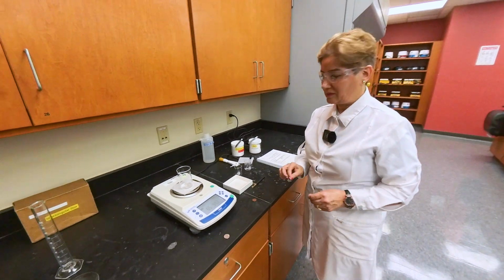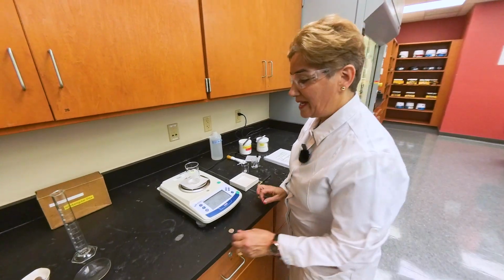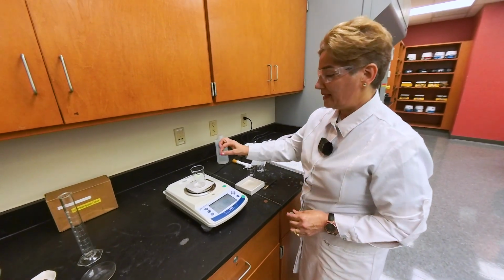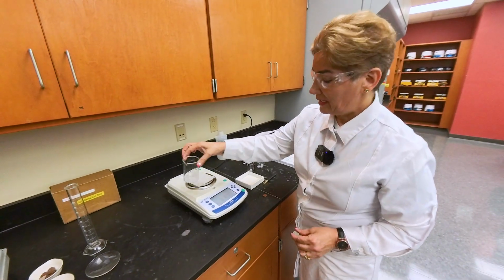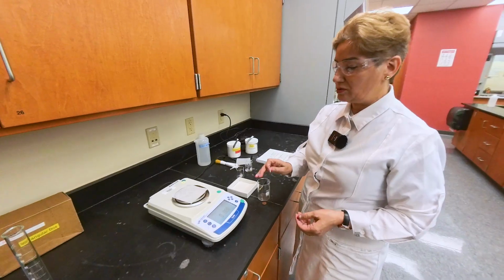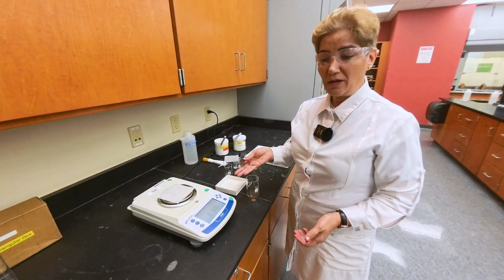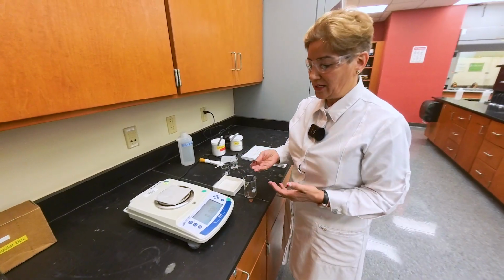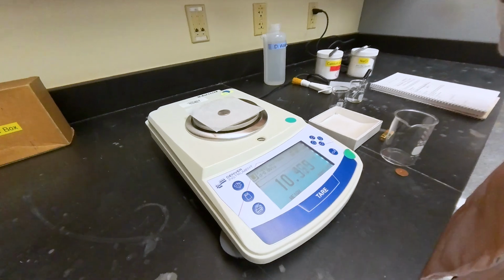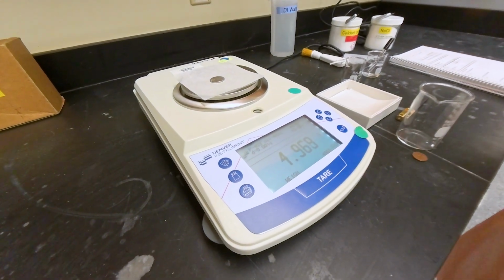You learn about the significant figures in lecture. In the lab, we put that in practice. What we do here is make sure that the number we are recording represents the accuracy of the measuring device. If I record too many decimal places that are not showing on the scale, it is a fake number, it is not ethical, I cannot do that. And if I only record one decimal place here, then I'm not presenting the accuracy of this device.